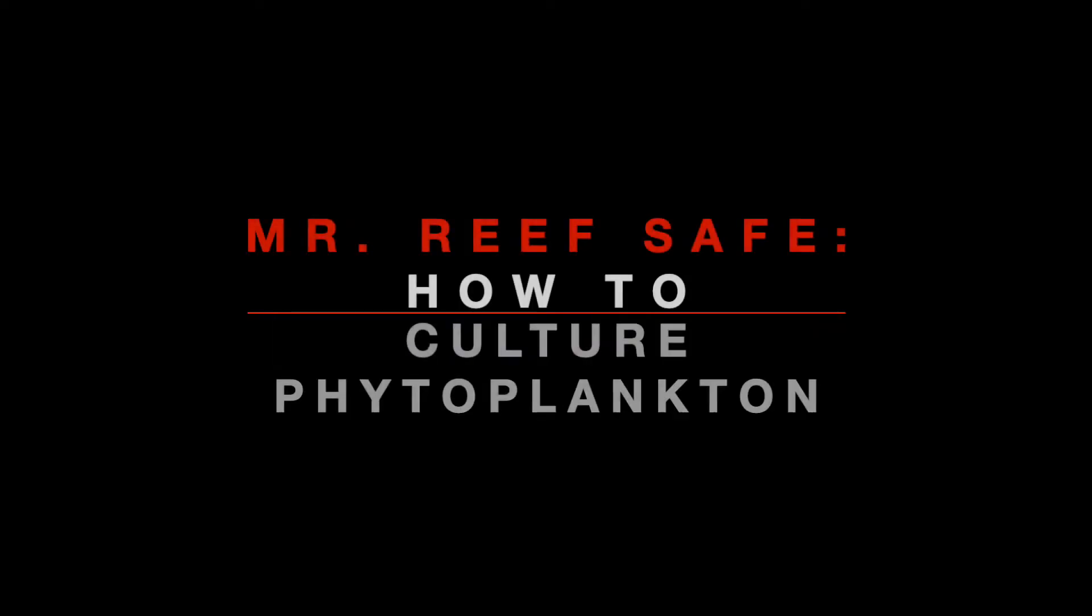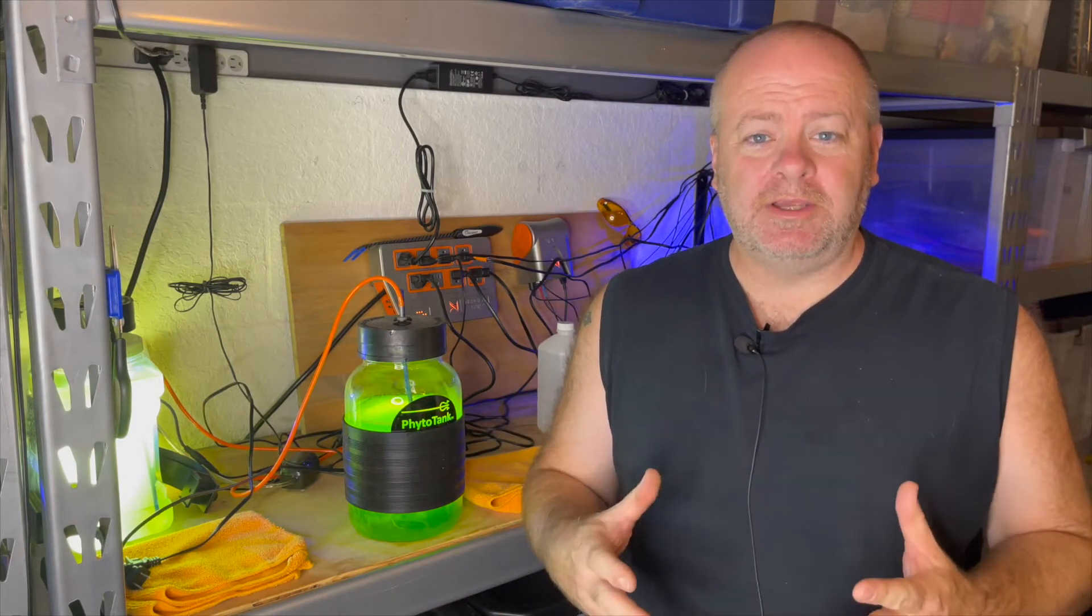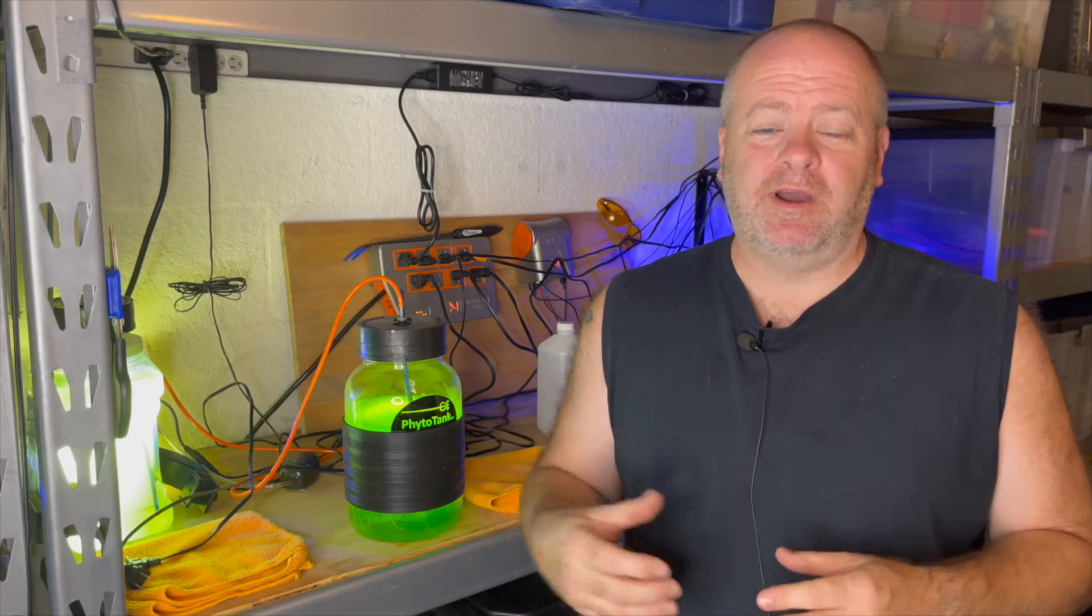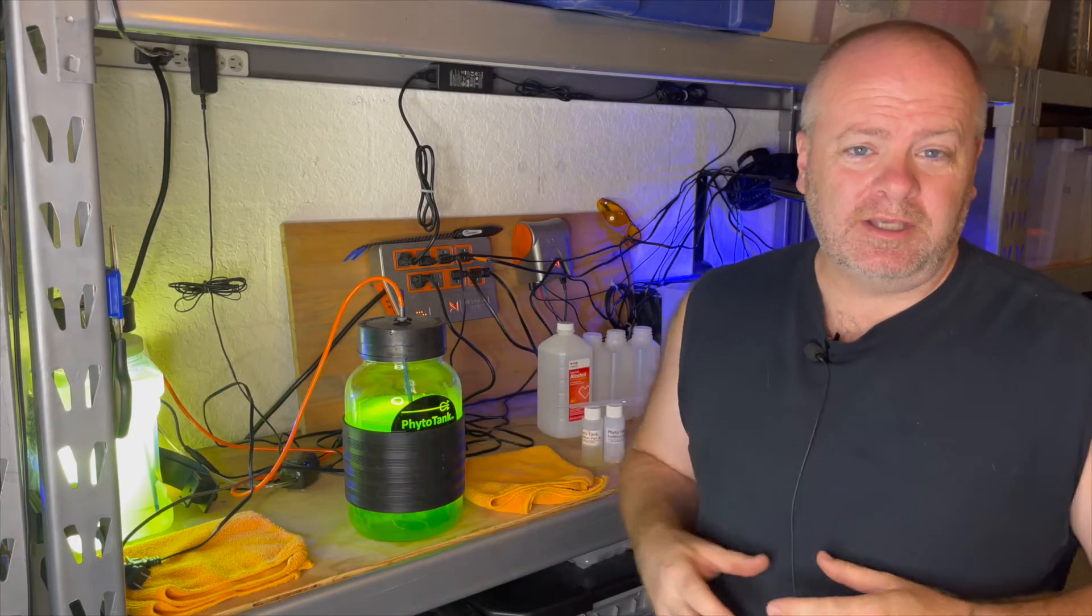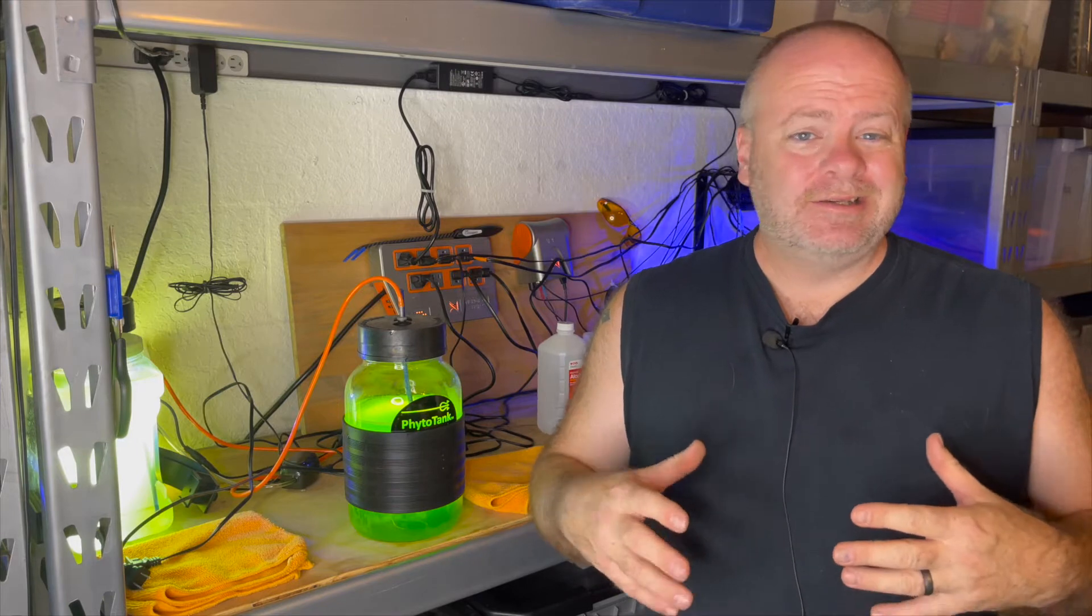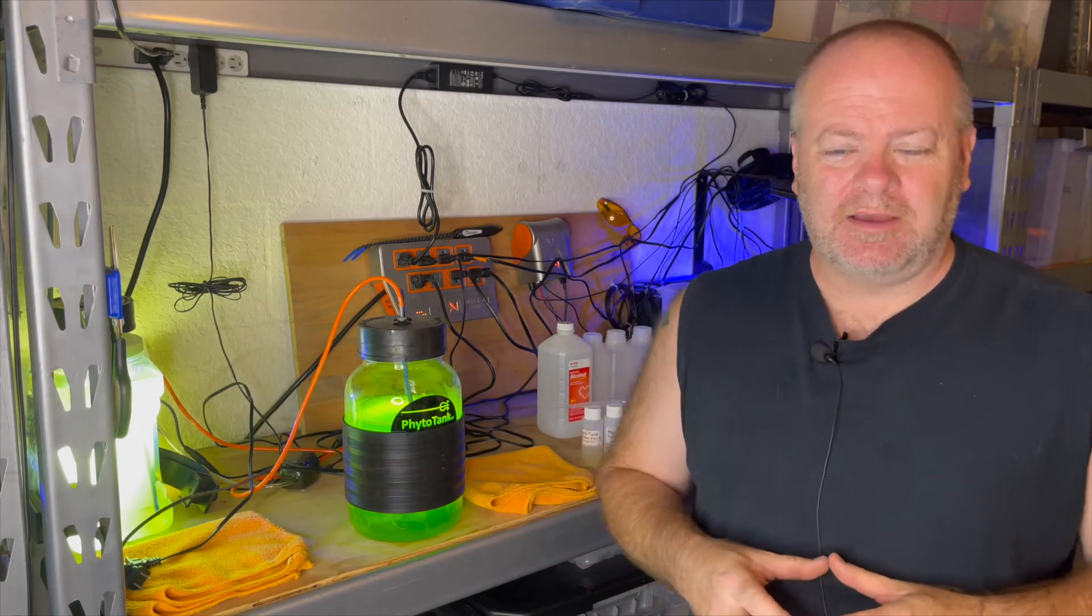Today I'm going to show you how I culture phytoplankton. Alright, first things first. I'm out here in my garage, partly because my fish tank room is also my wife's office and she's working today. But I also have to do the phytoplankton culture out here in the garage because it's kind of a little bit messy for the house. Plus, it's always making noise with the bubblers that you have to use.